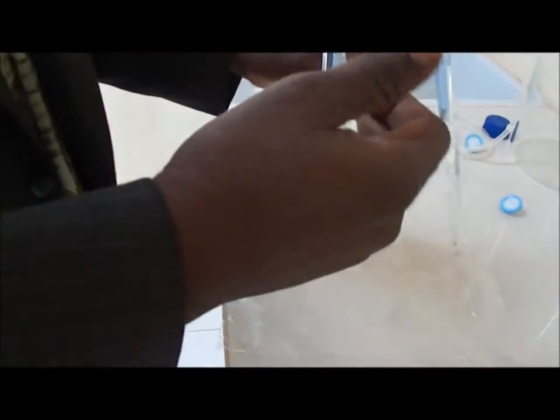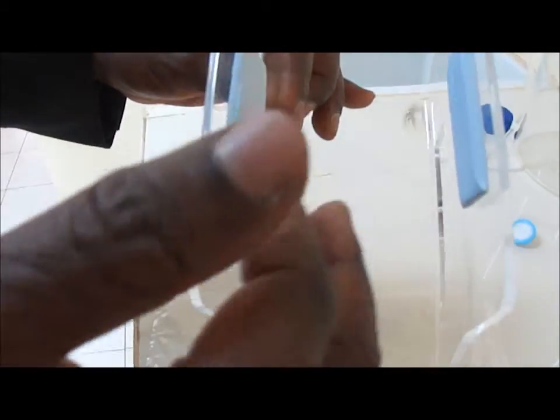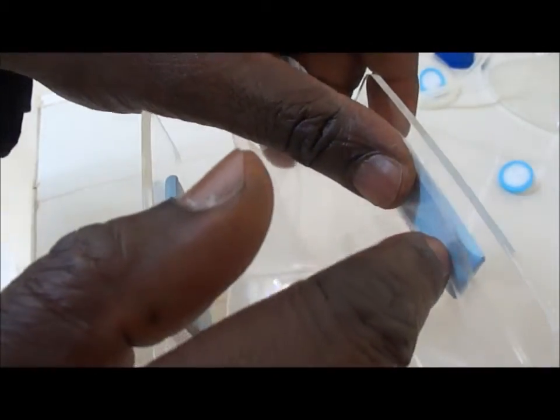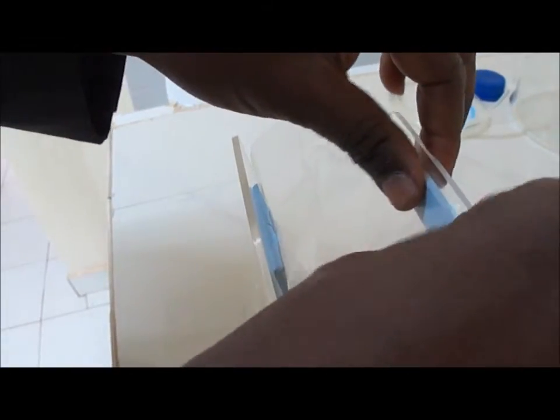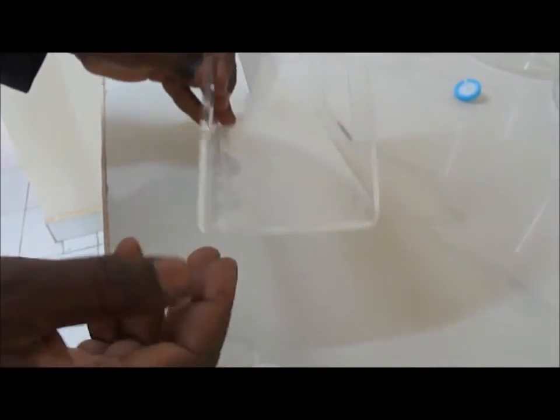And you see there is a kind of tape. You have some supplemental tapes in the box, and this tape will be used to maintain open inside the support the bag, and we fix it. There is a kind of glue on this tape, and we fix the opening of a plastic bag and maintain it with the tape, while the bottom of the plastic bag will be supported by the bottom of this plastic frame.